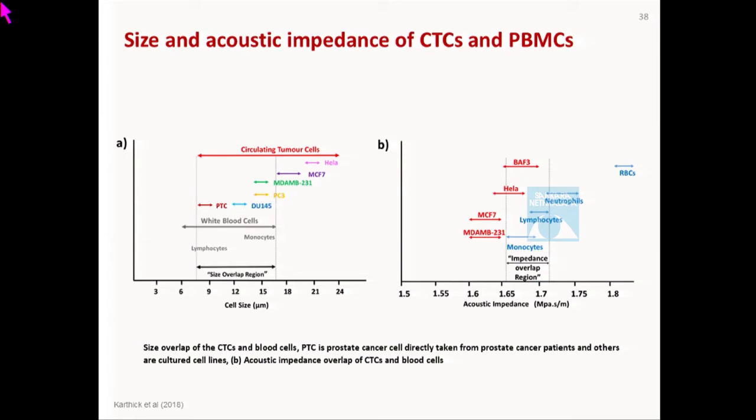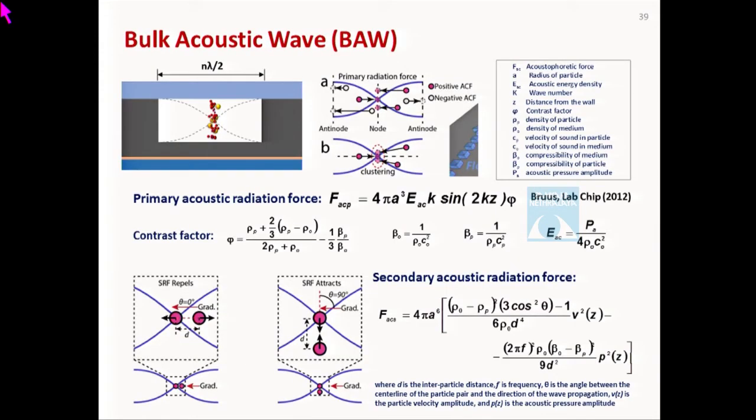And we use a technique called acoustofluidics. This is a technique that we have started in our lab in the last couple of years, and we are going forward with this as a promising technique because it can handle much higher throughput as compared to other microfluidic techniques. In acoustofluidics, you have a channel cross-section here, and you have a transducer. You generate what is called a standing wave. The transducer sends an incident wave, which gets reflected because the channel design allows that. And the superposition of incident and reflected waves gives you a standing wave. So you have a node here and you have an antinode here.